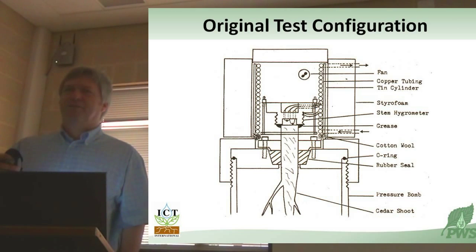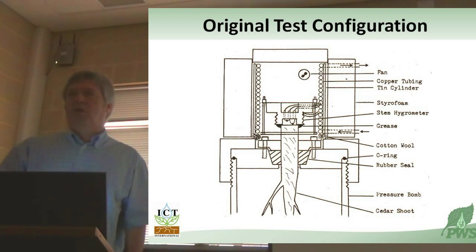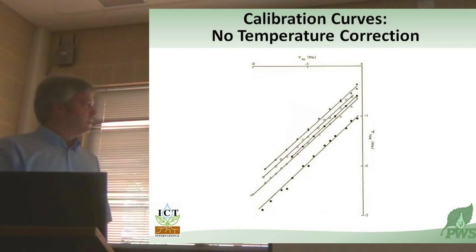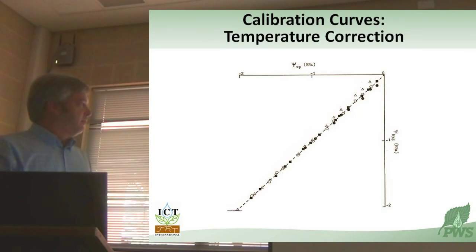I go for the empirical evidence. So I reached out and measured the sample surface temperature directly, and then correct for it at roughly 80 bars or 8 megapascals per degree. It's a very significant source of error. When you don't correct for it, you see a lovely linear relationship between the psychrometer measurement - or hygrometer, as we call it - and the pressure chamber, but the intercept is effectively an error. When you correct for the temperature, everybody's happy.